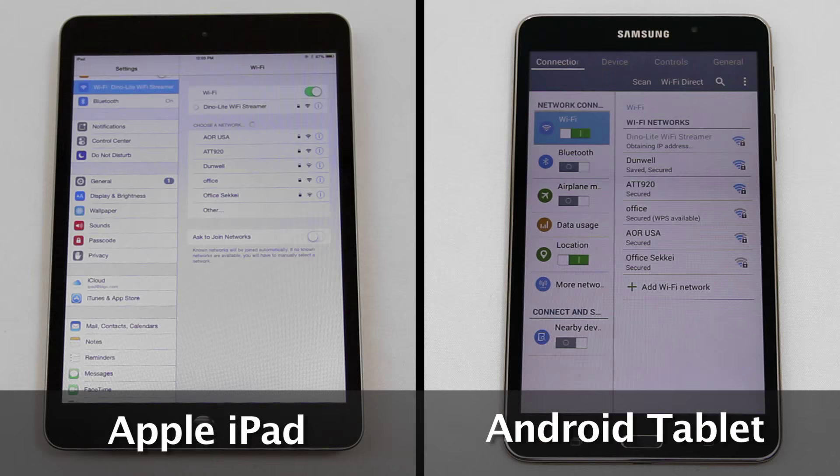Once the device is connected to the WF10 signal, open the Dynoconnect app and the streaming is live on the screen.